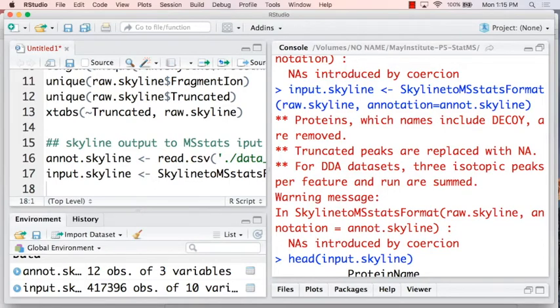Let's have a sticker update again. So how are we doing? People who succeeded, let's check how many unique proteins they have, how many zero values they have, how many NA values they have. So three things: if somebody succeeded in getting the input, the unique number of proteins, zeros, and NAs.